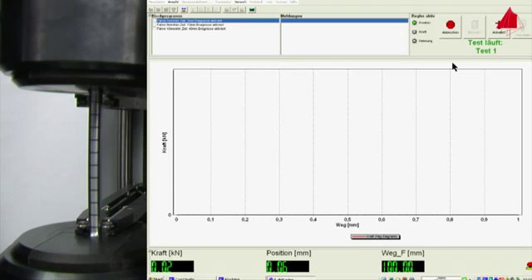During the tensile test, the test piece is slowly and constantly elongated with a standardized speed. The force that the test piece opposes to the imposed elongation is recorded and can be seen at the bottom left-hand corner of the computer display.